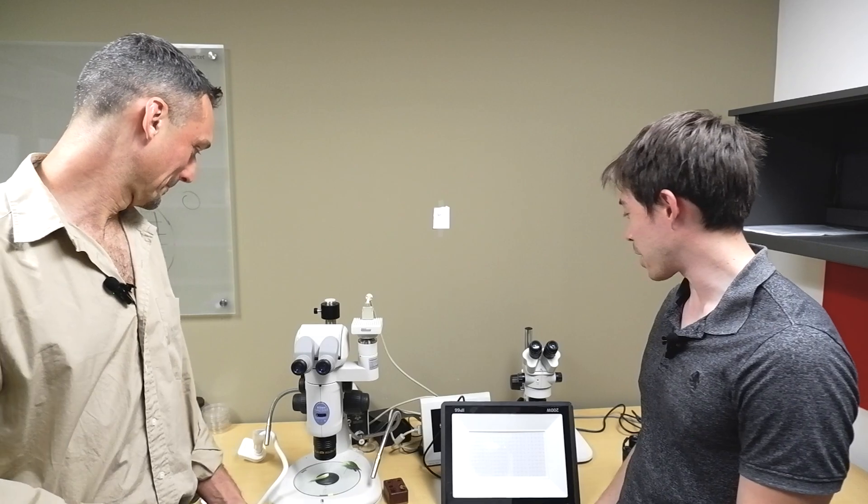We want to talk a little bit about black lights today because we're doing a project looking at agave mites, but they're very difficult to see, especially if you're trying to find them under a scope. So we used black lights to try to illuminate them and want to use that information to pass it on to you so you know what black lights you can use to better see agave mites.